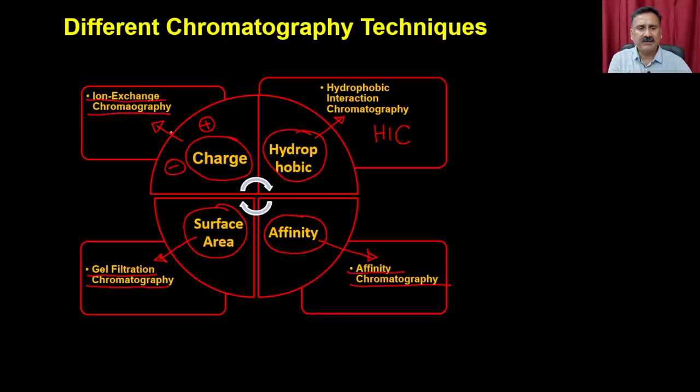So in this particular module, we are going to discuss these different chromatography techniques and how you can utilize them to purify the enzyme of your interest. So let's start our discussion with the first technique, and that is ion exchange chromatography.